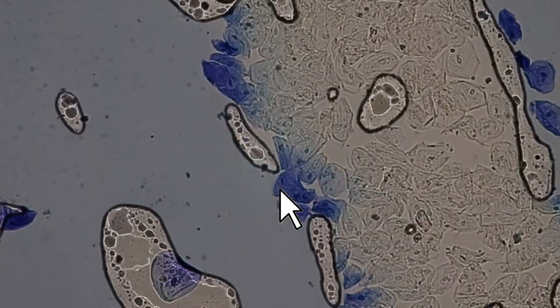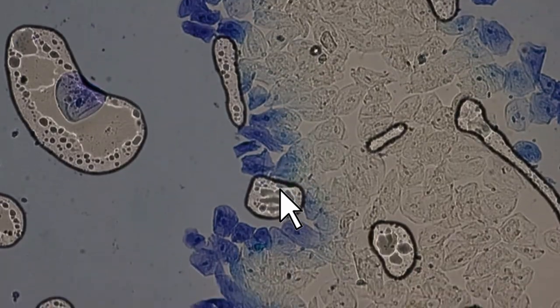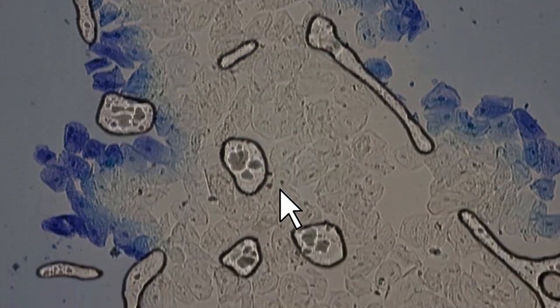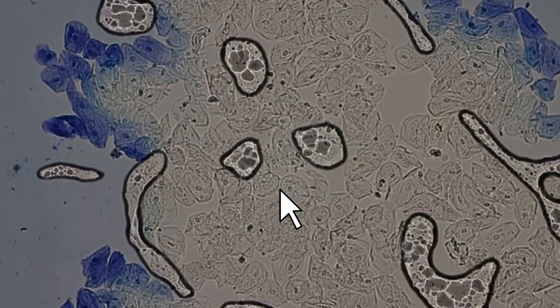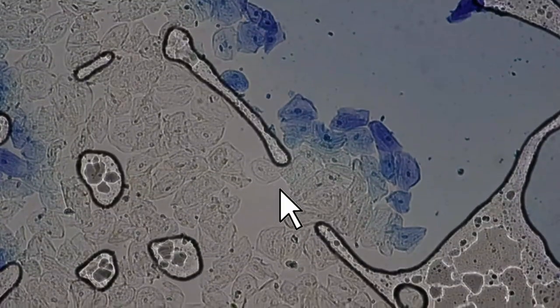You can see here as well, always on the side where it contacts the stain, this is where it turns blue first. And the cells here in the middle have not yet been stained because I did not give the slide enough time yet for the methylene blue to diffuse.